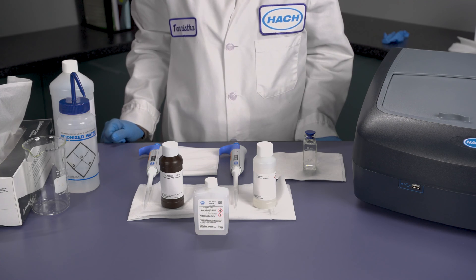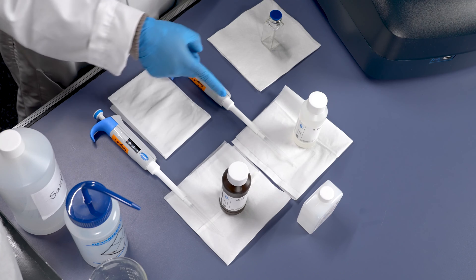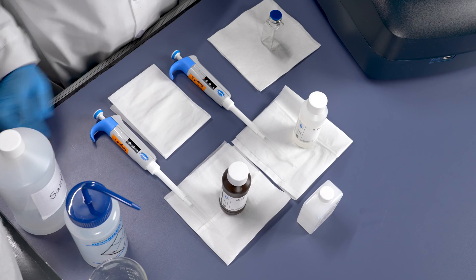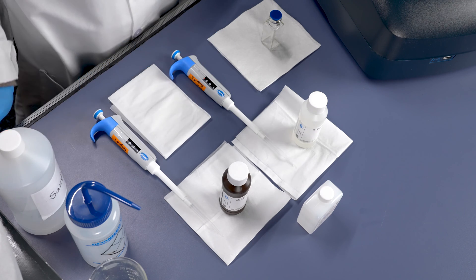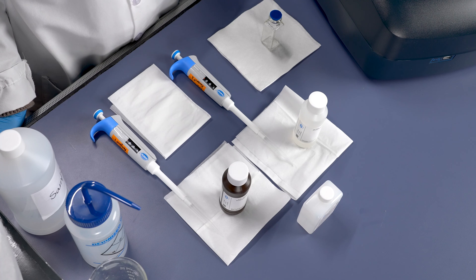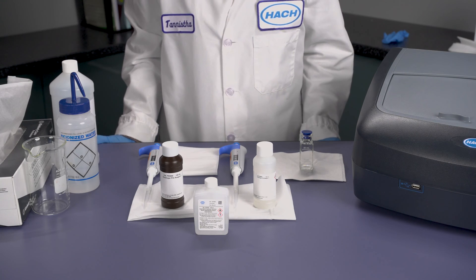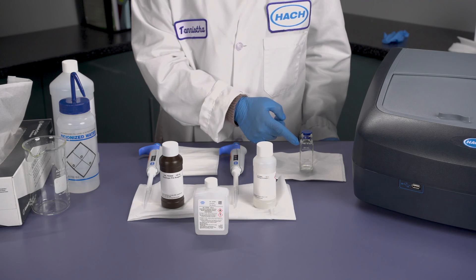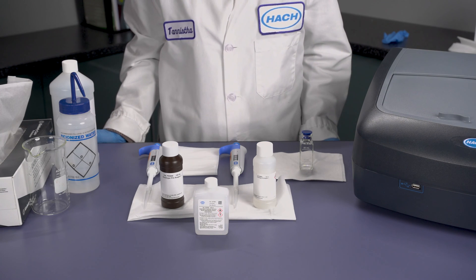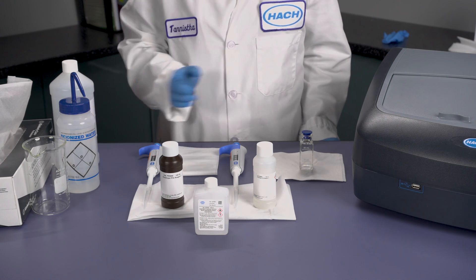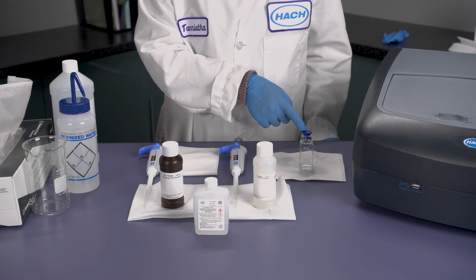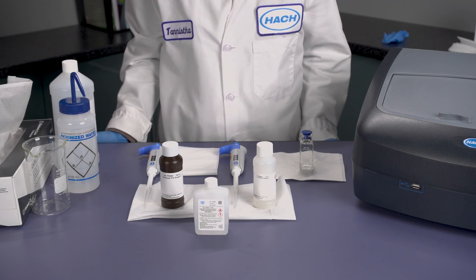For dispensing the reagents, you will need two separate pipetters, one for each reagent, as cross-contamination can be a significant issue. Also, after each method, you will replace the pipette tips. Never reuse the same pipette tip twice to prevent cross-contamination. Also important is a 25 ml sample cell. This sample cell is a typical Hach square sample cell with a mark at 25 ml for the sample. Also included is a rubber stopper. It's very important to use this rubber stopper with each test.